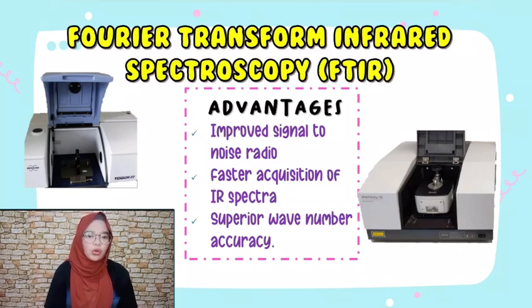Infrared spectroscopy is an active molecular vibration, hence it provides additional information on microplastic samples. The energy of the infrared radiation excites a specific vibration depending on the wavelengths. It will be absorbed to a certain amount, which enables the measurement of characteristic infrared spectra.